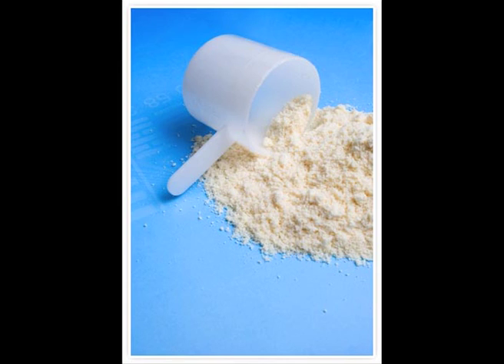Our procedure was very basic, consisting of 6 beakers with different concentrated trypsin solutions: 0%, 1%, 2%, 3%, 4%, and 5% trypsin. These beakers were used for the film to be placed in. With this setup, it was possible to test how different concentrations of trypsin, an enzyme that breaks gelatin down, affected the clarity of the film. Because gelatin breakdown is directly related to film clarity, this lab setup and procedure are very efficient in testing whether or not a more concentrated trypsin solution allowed for more clear or less clear film development.